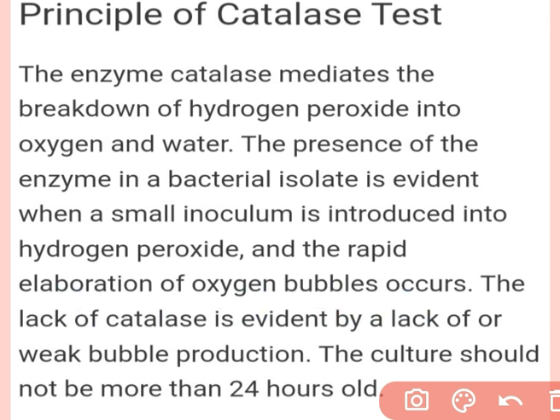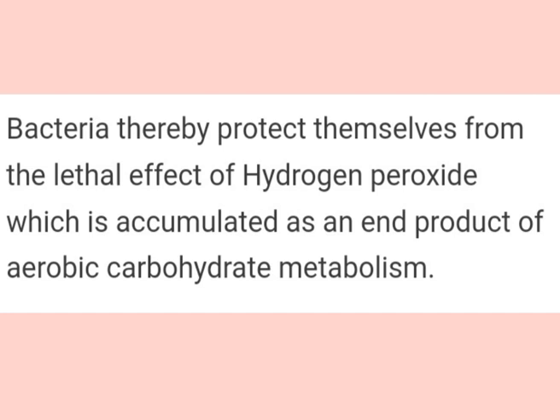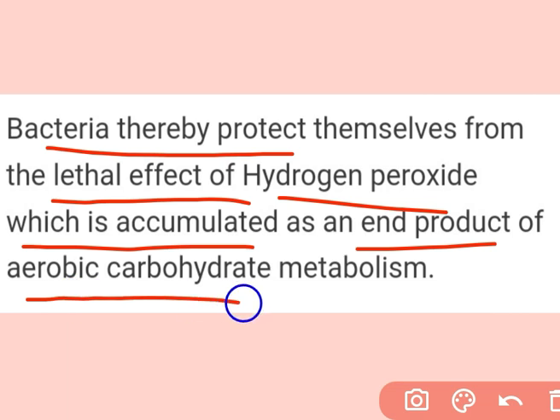The lack of catalase is shown by a lack of bubble formation. The bacteria thereby protect themselves from the lethal effect of hydrogen peroxide, which is accumulated as an end product of aerobic carbohydrate metabolism.